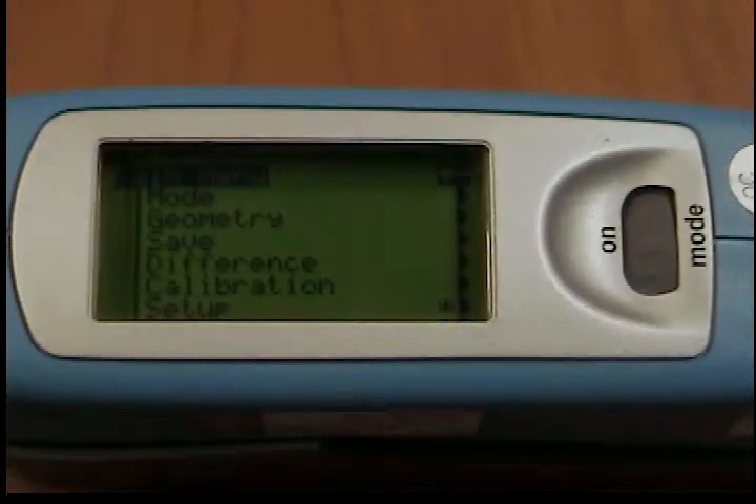How to set up your Micro Trigloss Gloss Meter. You can make general settings in the setup menu, for example, language or display time.